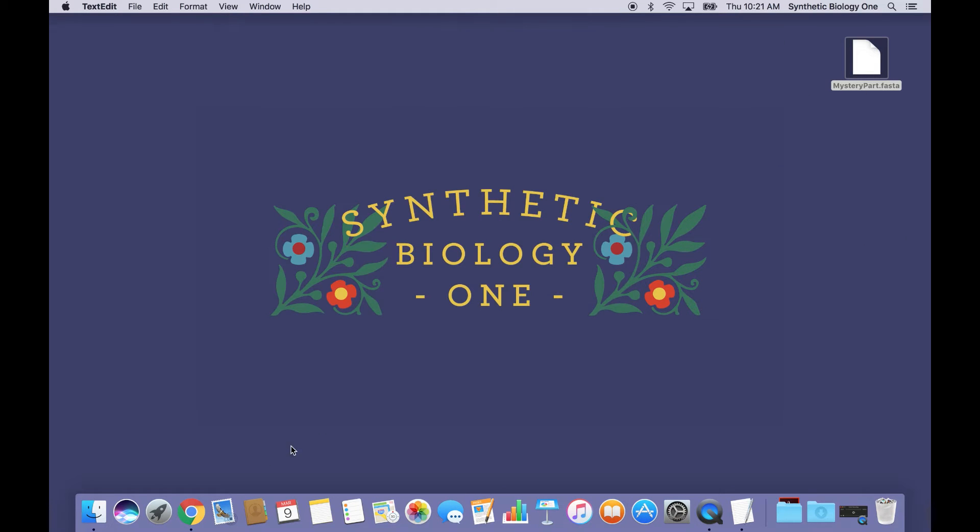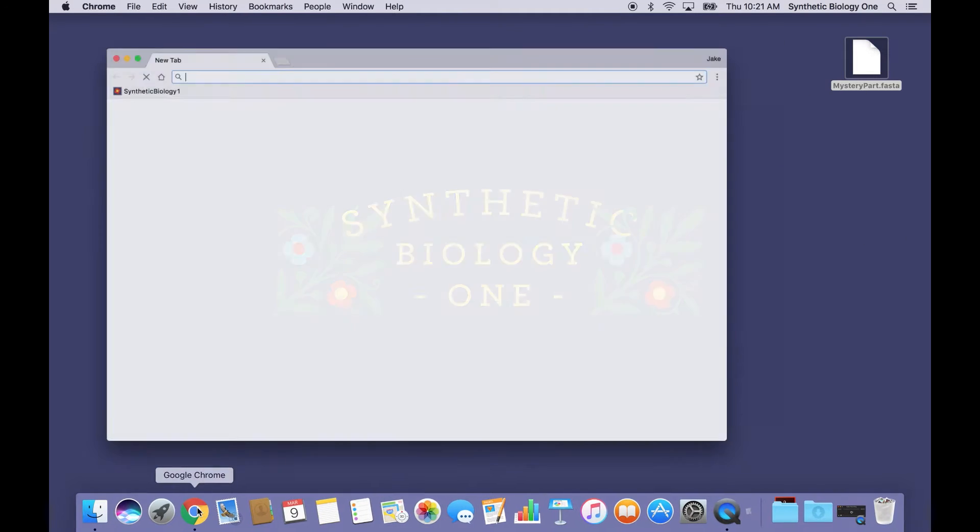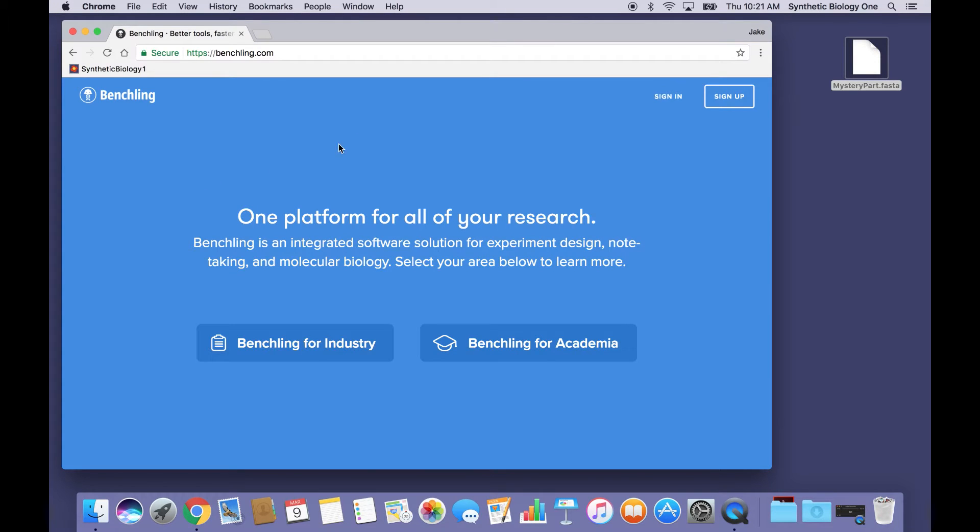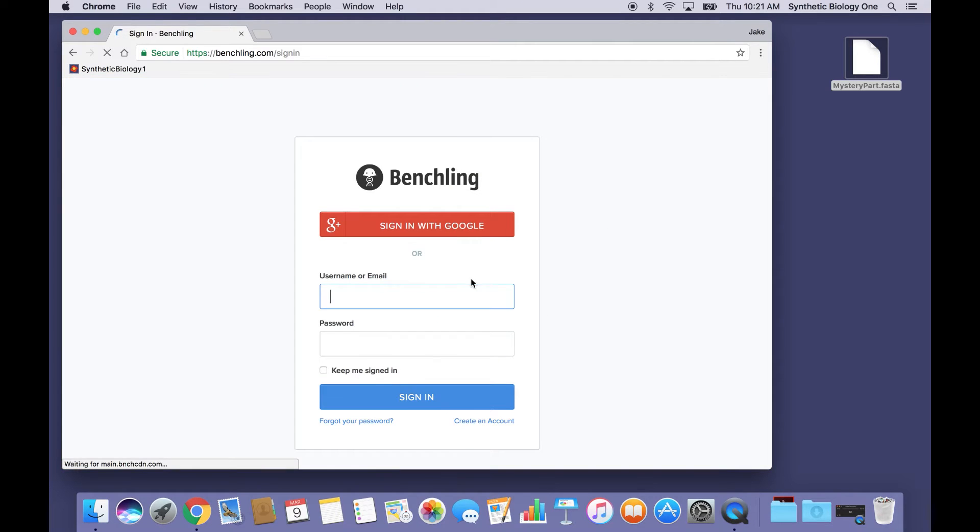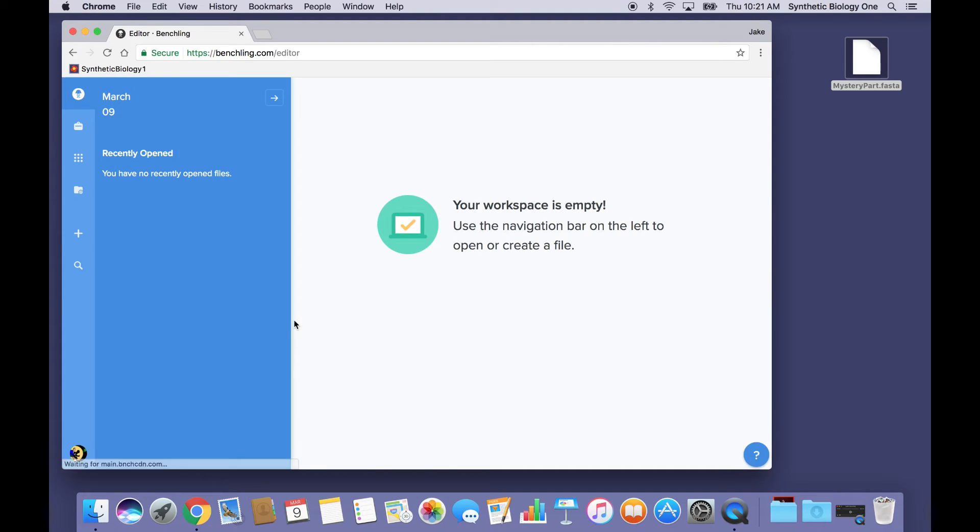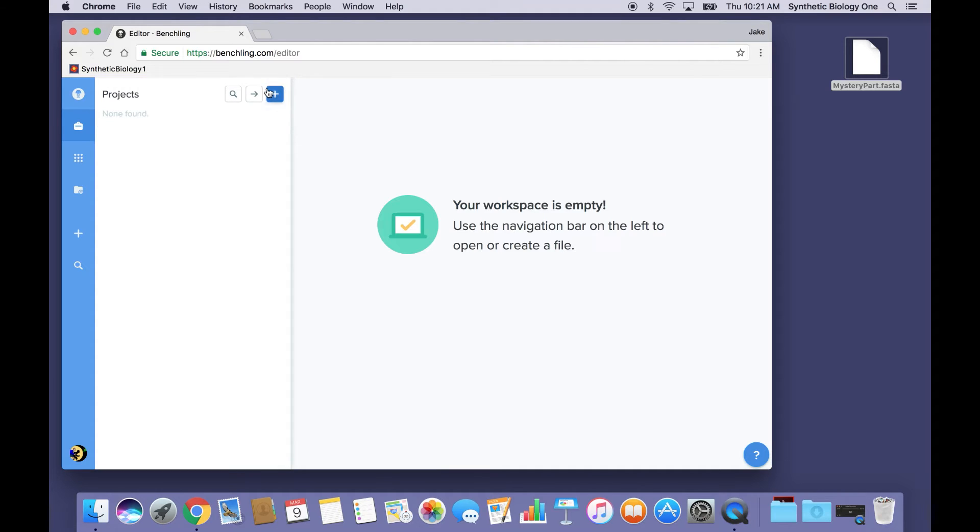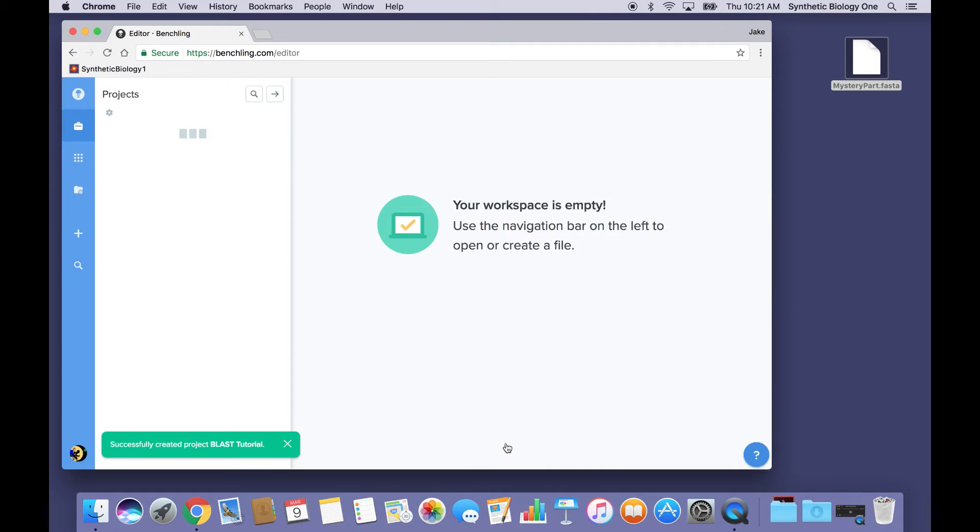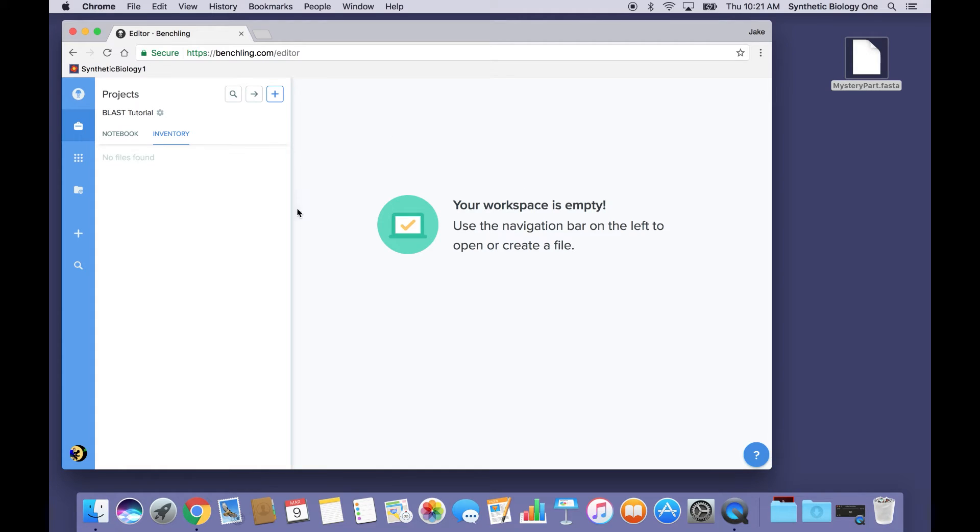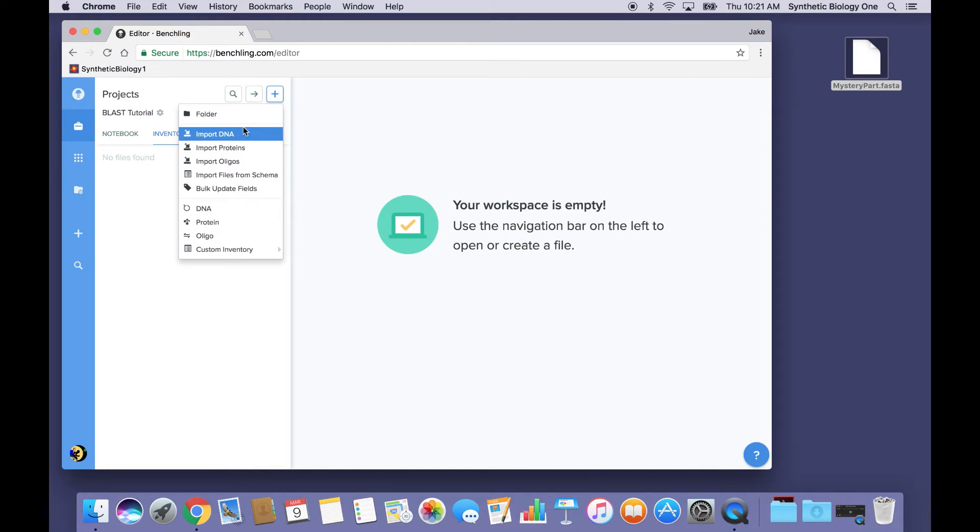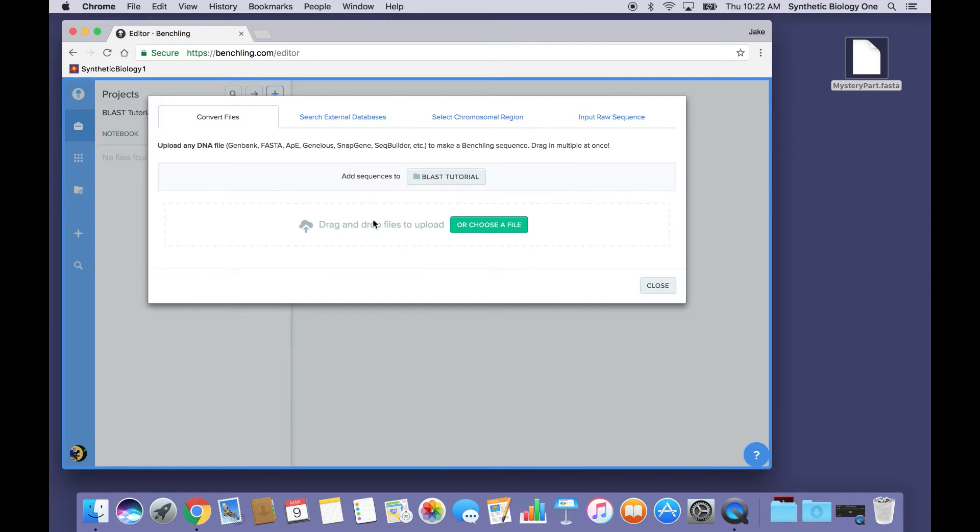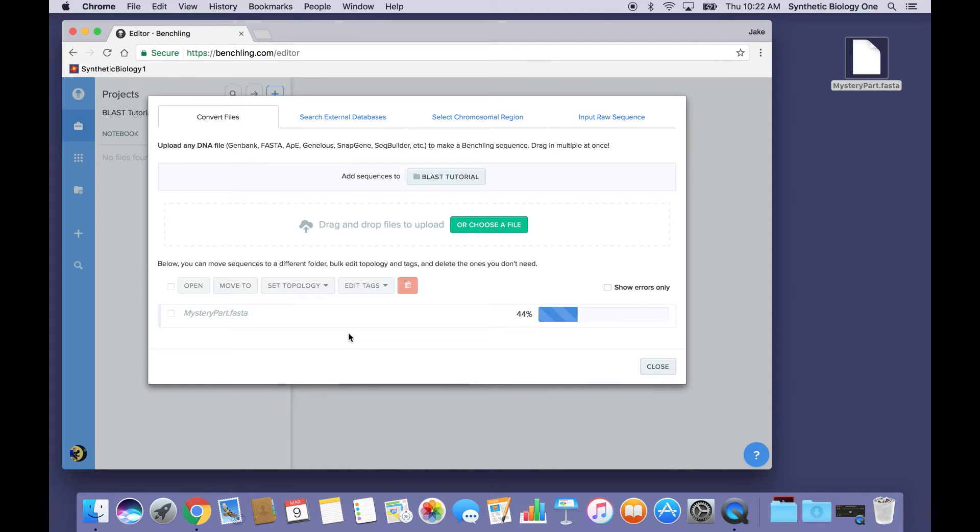So how are we going to do that? First, I'm going to open up a web browser, and I'm going to go over to my DNA Sequence Editing software and sign in. I'm going to create a new project called Blast Tutorial, and I'm going to import this new DNA Sequence in the FastA format, which I can do just by dragging and dropping.